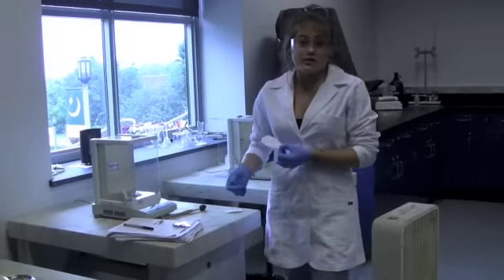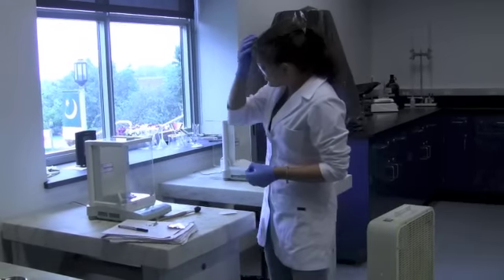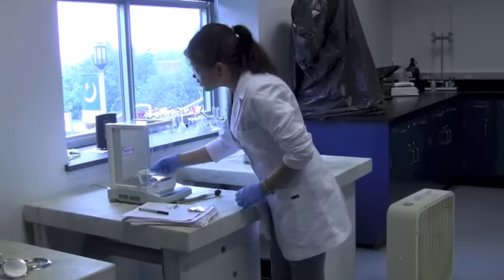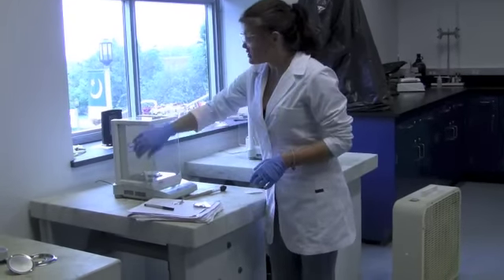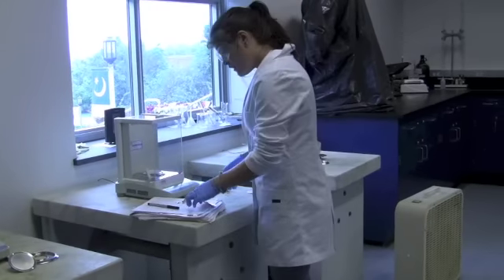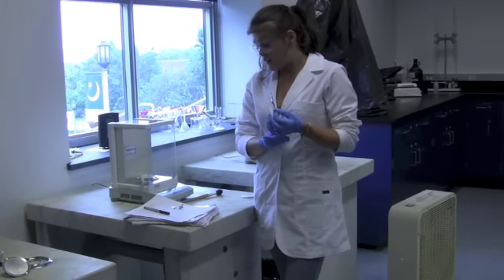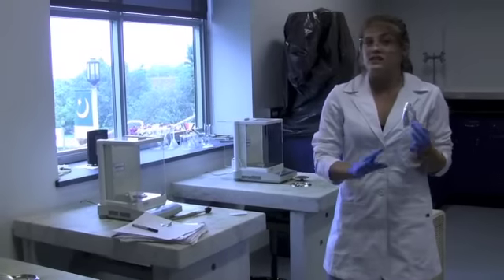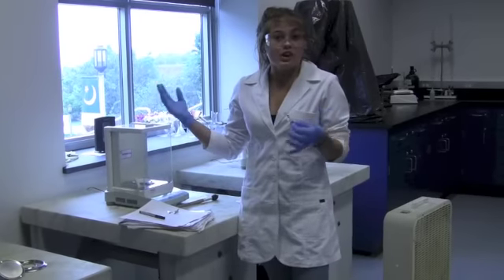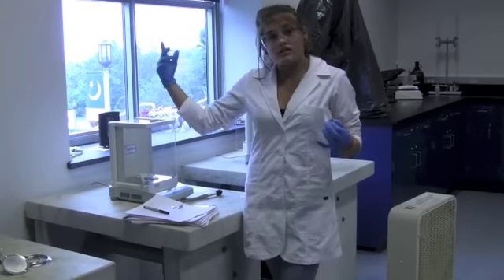The first thing we need to do in this experiment is get approximately 0.5 grams of aluminum foil. When using a scale, always make sure to use a weighing paper so as not to contaminate anything. You place the weighing paper in, close all the doors to make sure that no air disrupts anything, and tare your scale, zero it out. Now, always make sure to record your numbers to 4 decimal places. And you need to make sure to not waste too much time trying to get exactly 0.5000 grams. It could be anywhere from 0.49 and then numbers after that to 0.51 something.